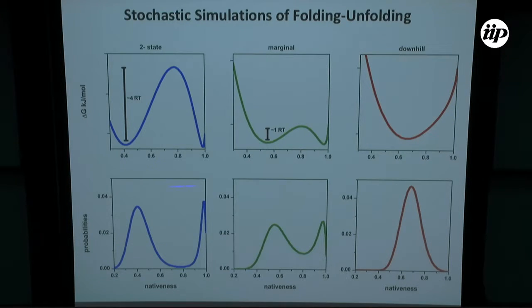So now we can do stochastic simulations of this kinetically using the rate matrix. So we can actually do a simulation of what a molecule would do. We can also put the photon emission numbers into that, and then see whether the analysis can retrieve back what you put in. In this case, we know the answer. And what we're trying to test is how the procedure works, right?